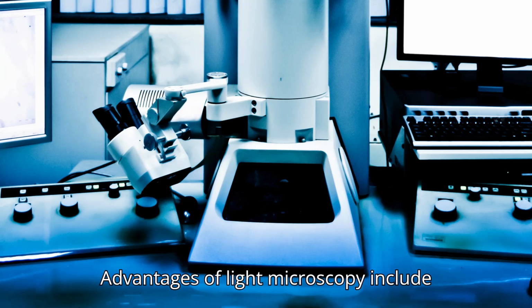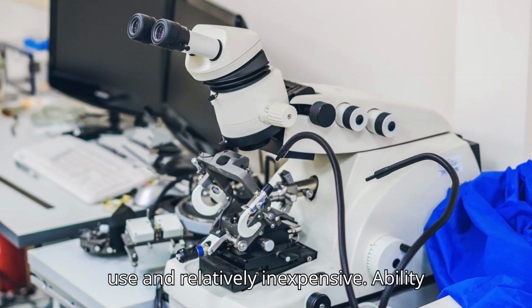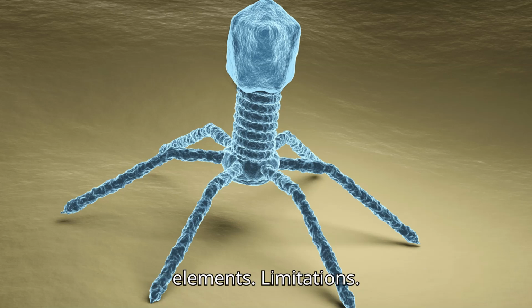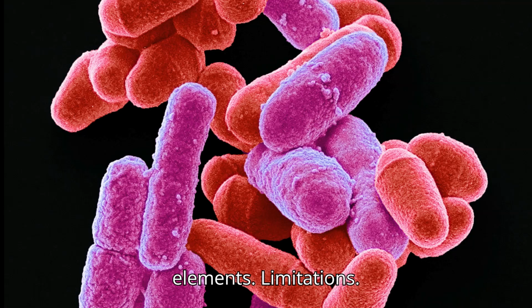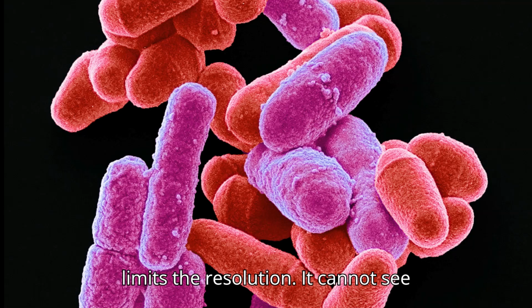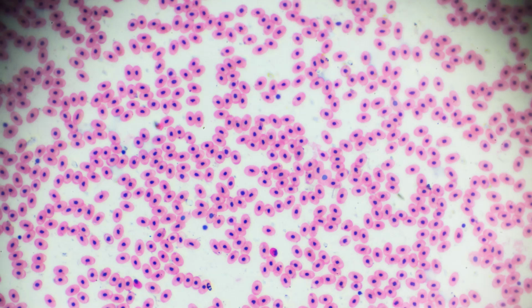Advantages of light microscopy include the ability to observe dynamic processes and living cells. Easy to use and relatively inexpensive. Ability to apply a number of stains and colors to draw attention to particular structural elements. Limitations: the wavelength of light, 200 nanometers, limits the resolution. It cannot see things smaller than that, such as viruses or molecular complexes.